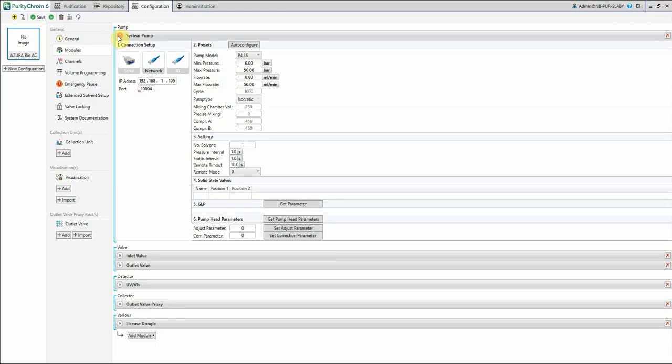Devices connected by COM port are added via serial. The other connection mode is LAN. By default, all NOR devices arrive with a fixed IP address which needs to be added in network together with the correct port number. It is also possible to browse devices by ID, but the network option is recommended.